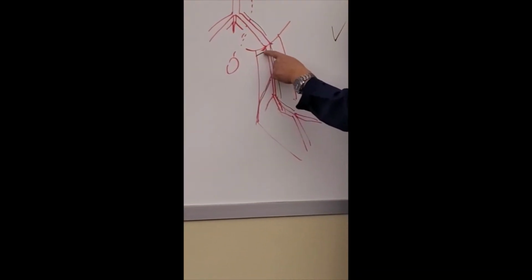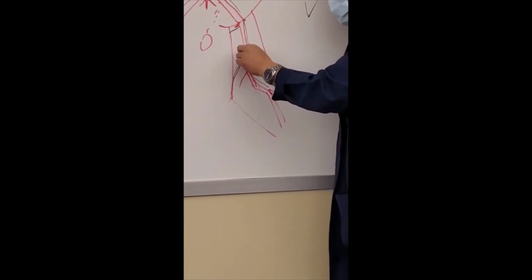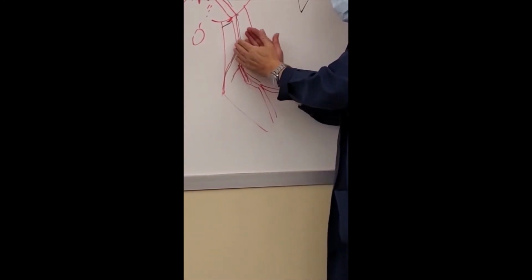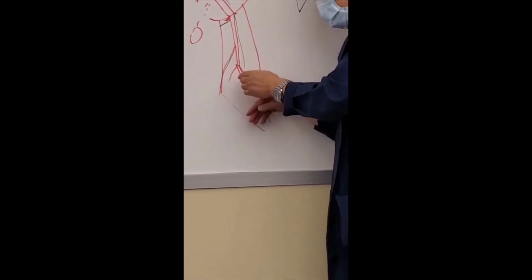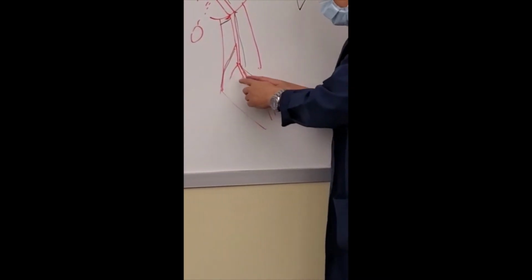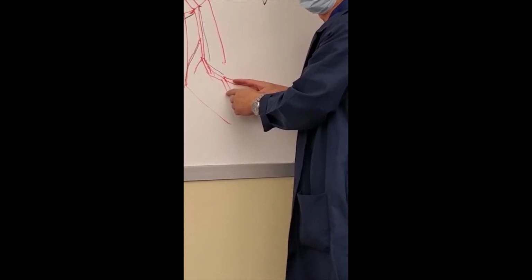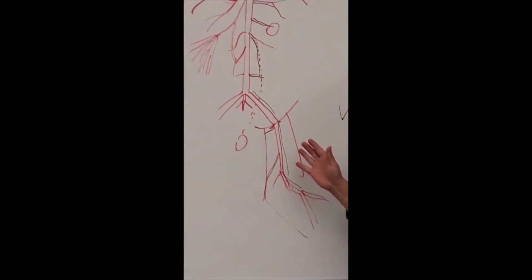Okay, you get deep femoral going to the medial side. Okay, then you get saphenous branch. Okay, then you're going down a little bit. Okay, finally get to the back of the knee, becomes popliteal. Popliteal's branch becomes anterior and posterior tibial. That's all for the artery.